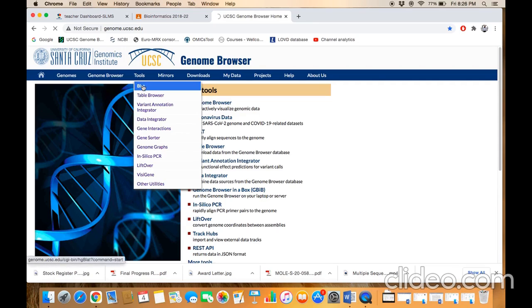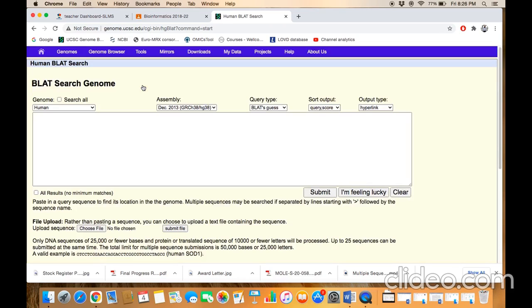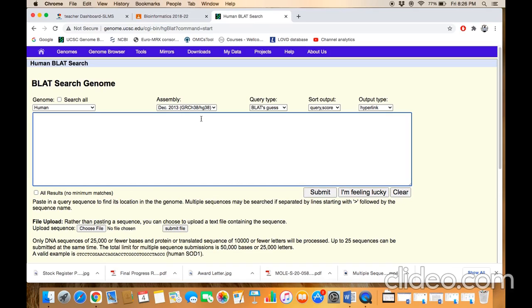Here is the query box where you need to paste the sequence, the query sequence, the sequence under investigation.